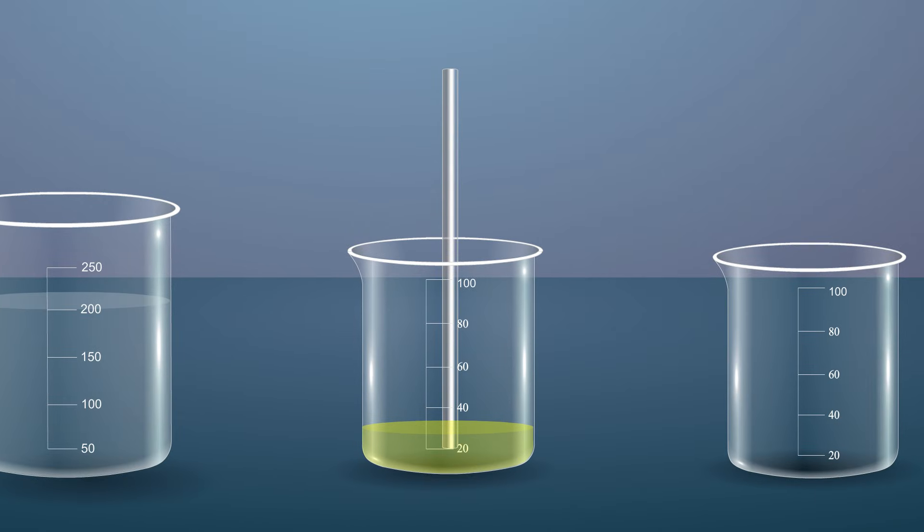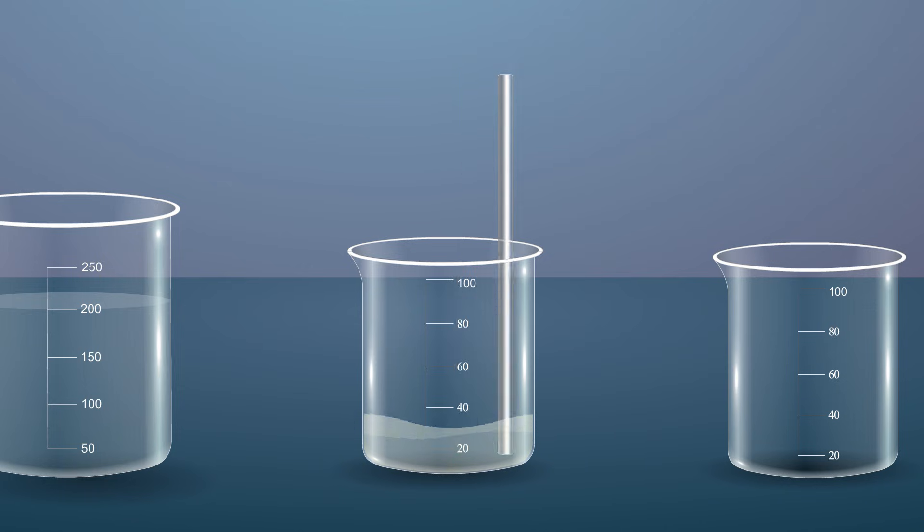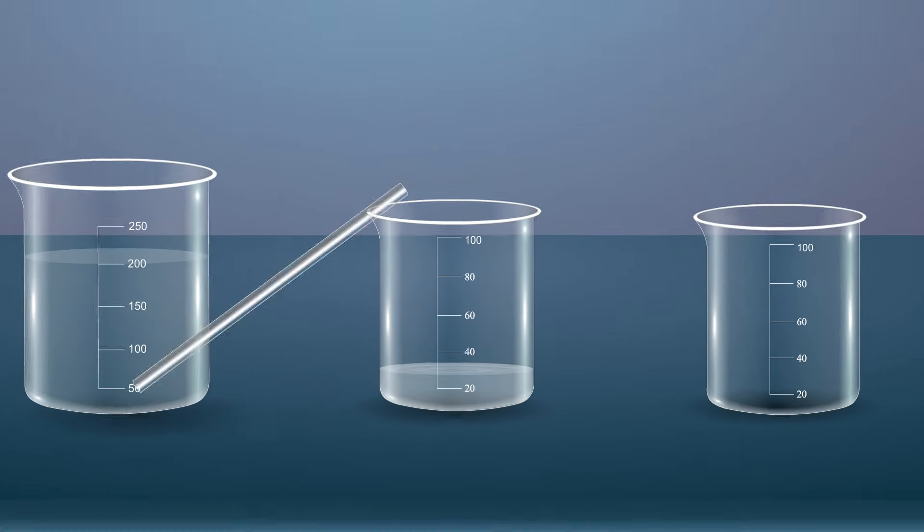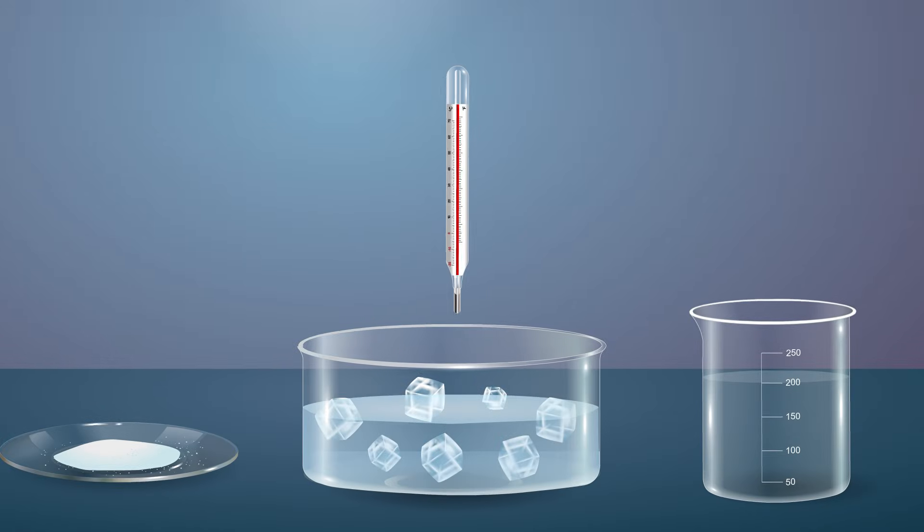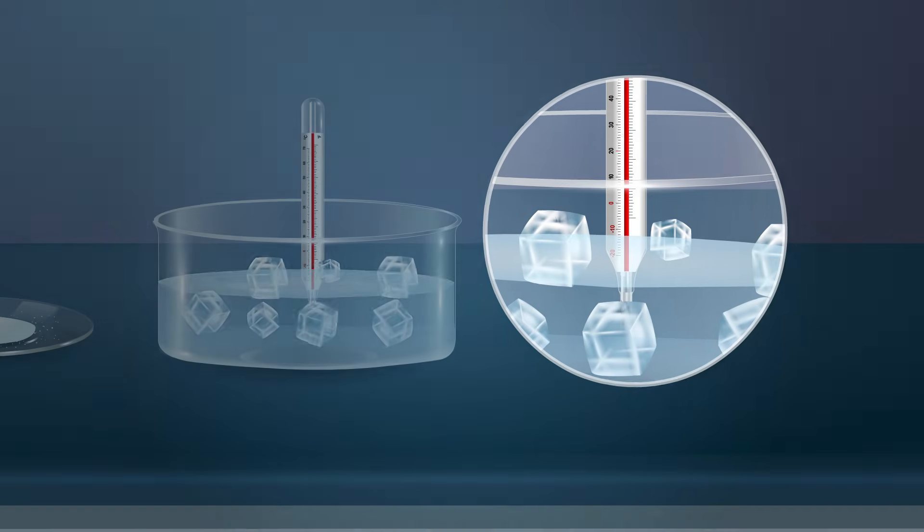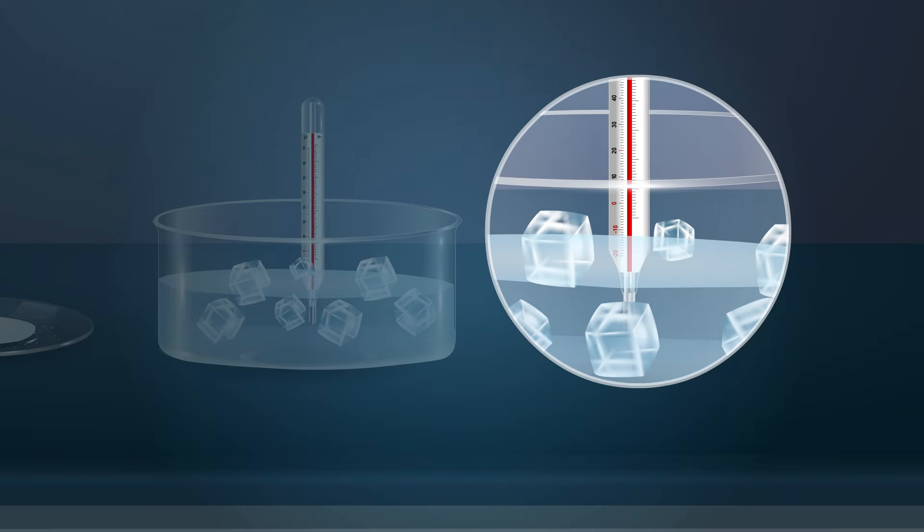Dissolve the mixture thoroughly with a glass rod to get a clear solution. Cool the solution by placing it in an ice bath and check the temperature using a thermometer. It should be 5 degrees Celsius.